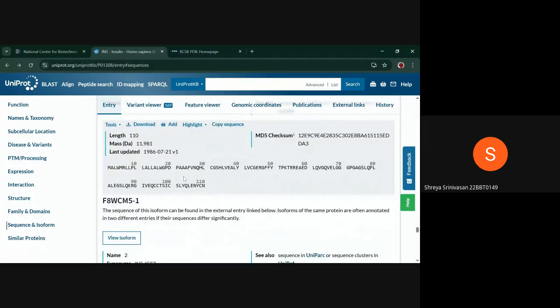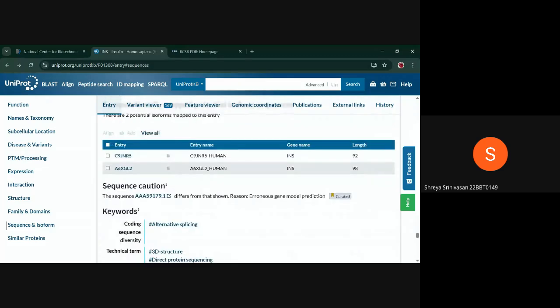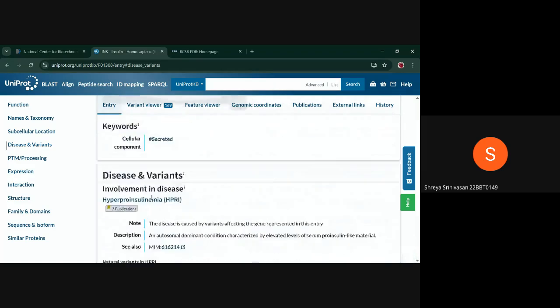Just note down that this FASTA sequence will be utilized somewhere else also today. But just to let you guys know what it is, I'm showing the rest of it here. And yeah, this is the mass. It shows the weight of this particular protein, which is approximately 11 kilodaltons. And I'll show you one more very interesting thing in the software.